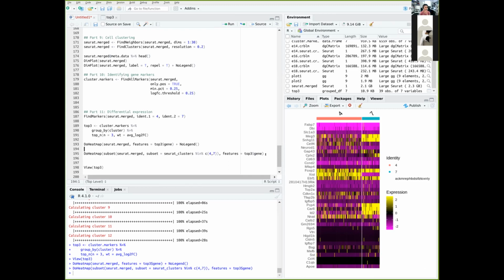There is another way. Let me see. What I thought of earlier on, it slipped my mind after I spoke about this method. But okay, let's go with this first. Probably there's an update to Seurat functions, and you can actually do this a bit better. Or if anybody else knows a better method, you can voice out right now.